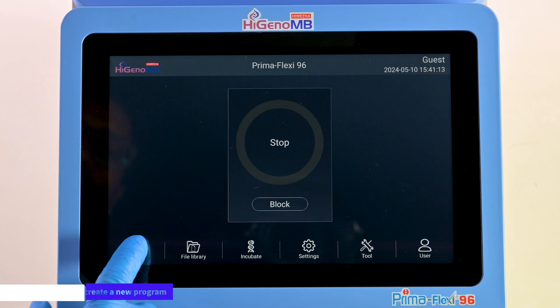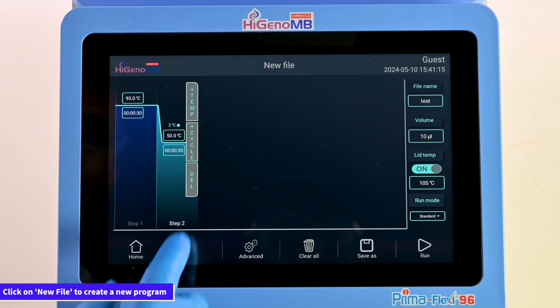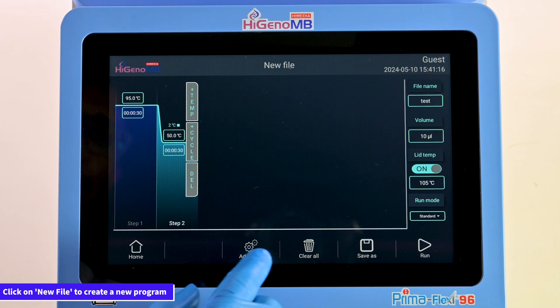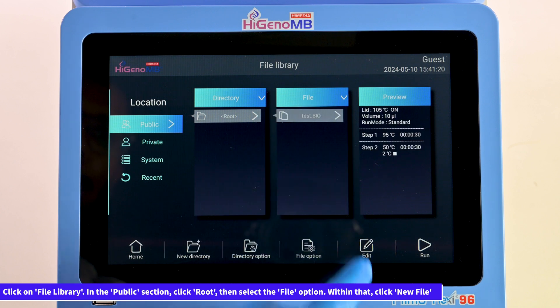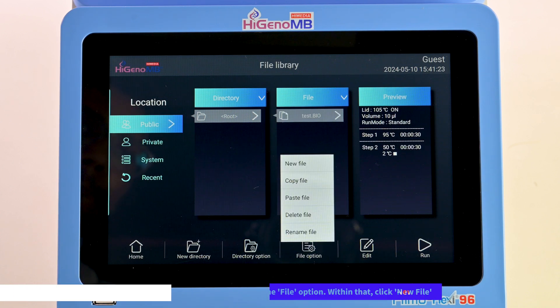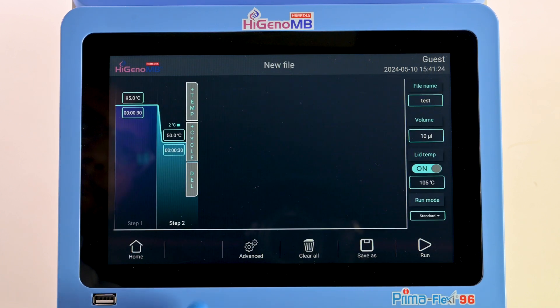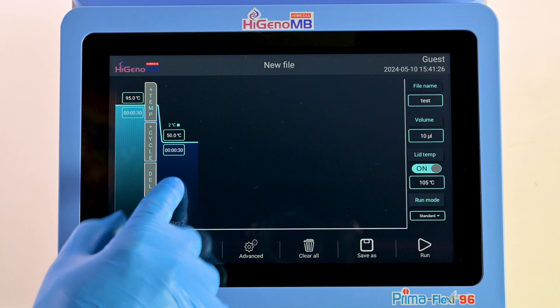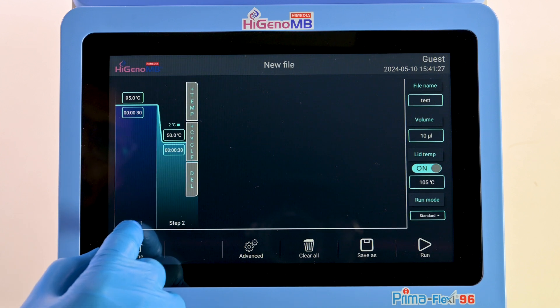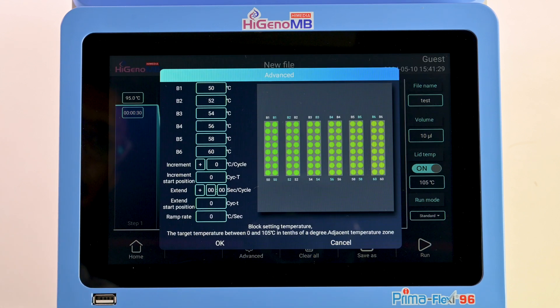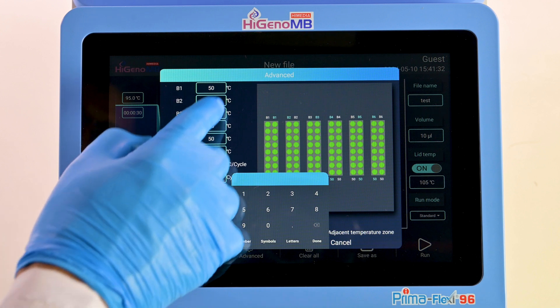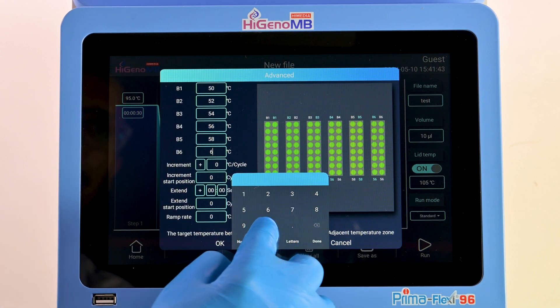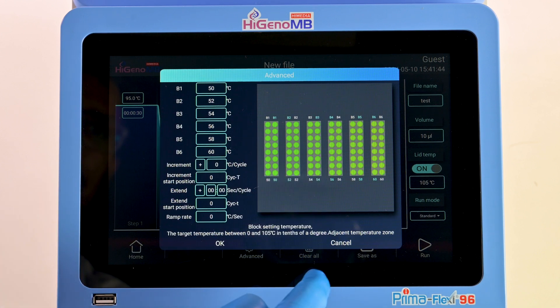Click on New File to initiate a new program. Navigate to File Library in the Public section, select Root, then File, and finally New File. Next, set the parameters such as temperature, cycle time, or delete as needed. Click on Advanced to adjust the gradient temperature, increment, extent, or ramp rate.